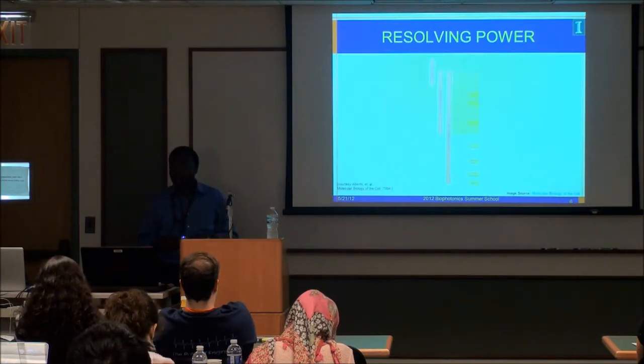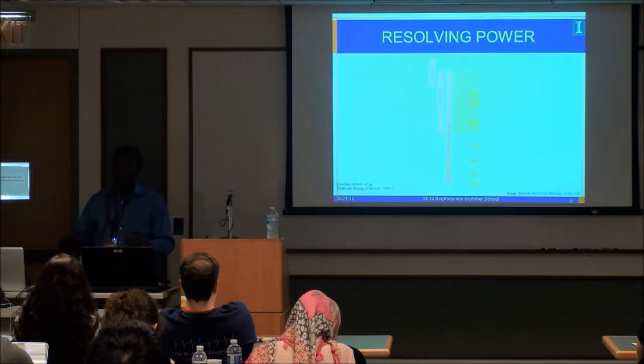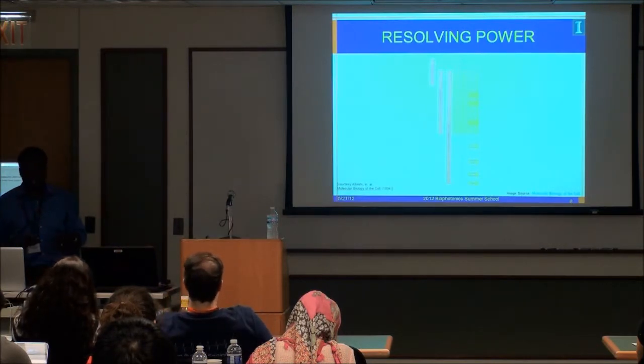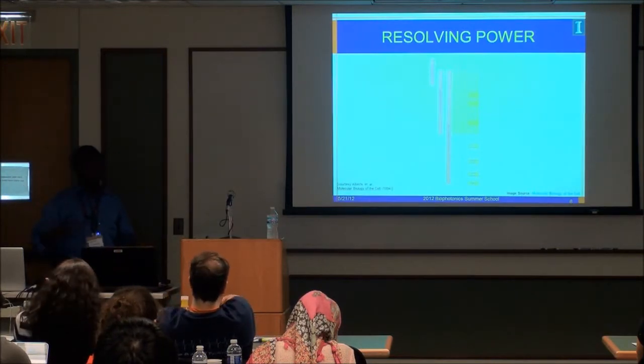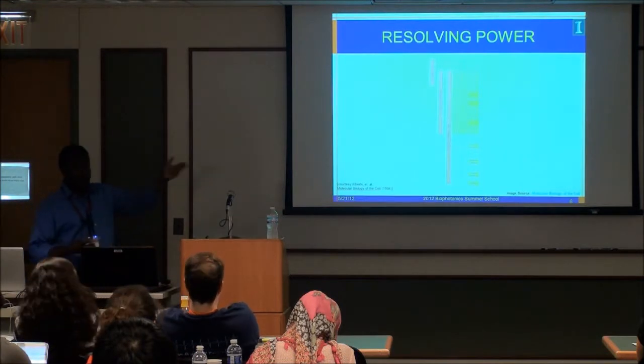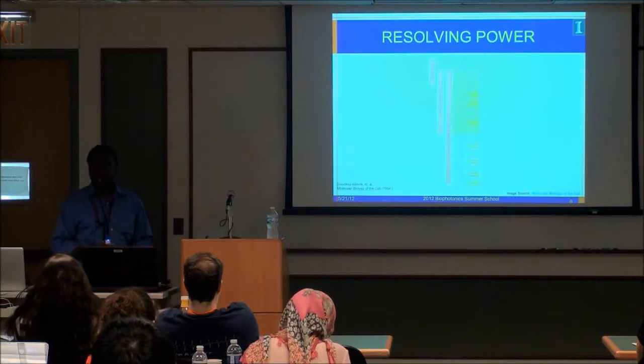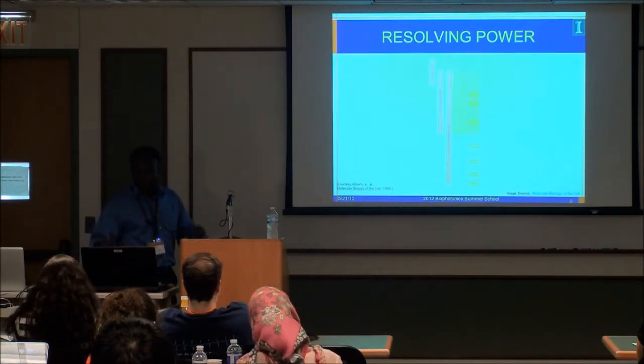You move to using an electron microscope, and there are trade-offs, right? So it's the wavelength associated with the electron, the de Broglie wavelength, which is much shorter than the wavelength associated with visible light. So the wavelength is what tunes how well we can see things, to a large extent.